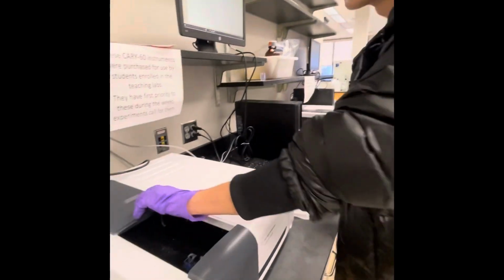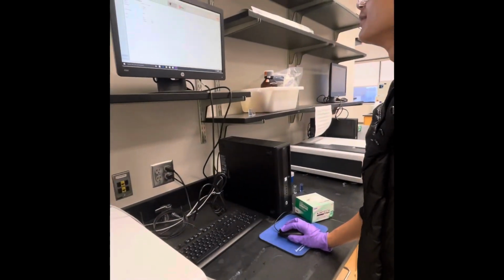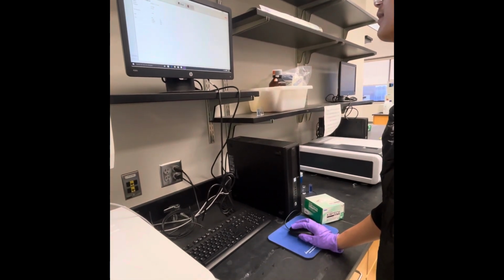Take your cuvette, you're going to have to blank it. You're going to have to run your cuvette samples with read, or with start, read, whatever it says in there, and be able to identify.